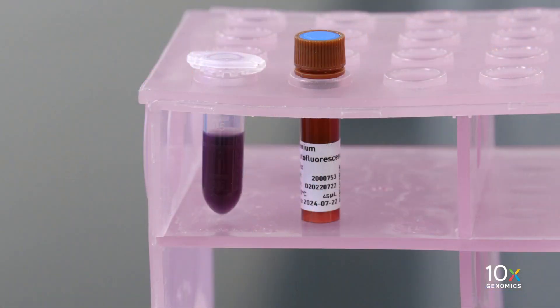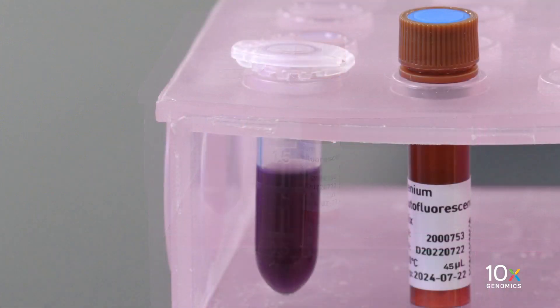Next, we will review the autofluorescence quenching protocol. The autofluorescence mitigation step in the assay workflow utilizes a 10x proprietary quencher. Dilute the autofluorescence mix as detailed in the user guide. The diluted quencher is purple in color.